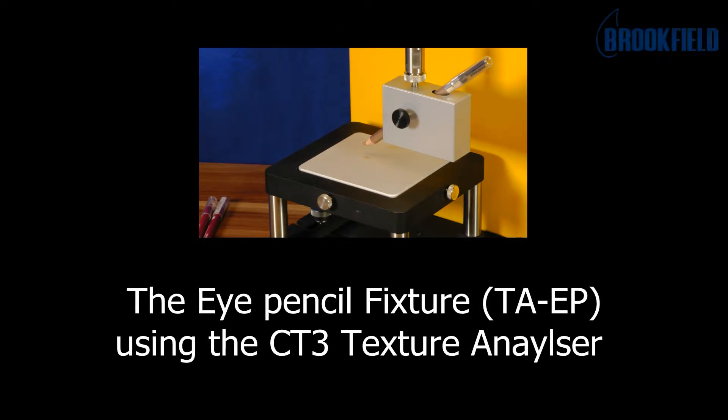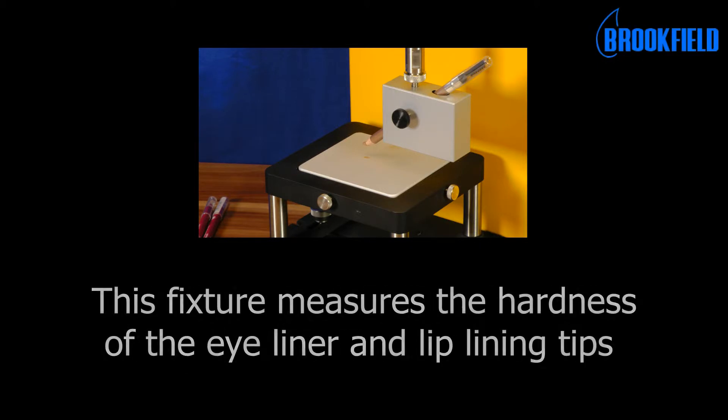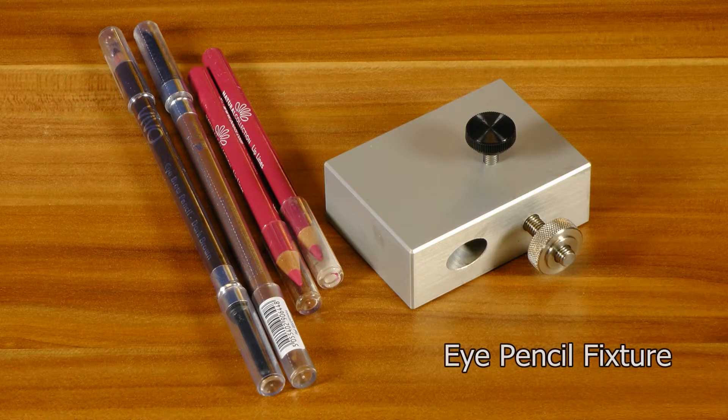This is the eye pencil fixture using the CT3 Texture Analyzer. This fixture measures the hardness of the eyeliner and lip lining tips. Here you see the fixture that is used in the test.